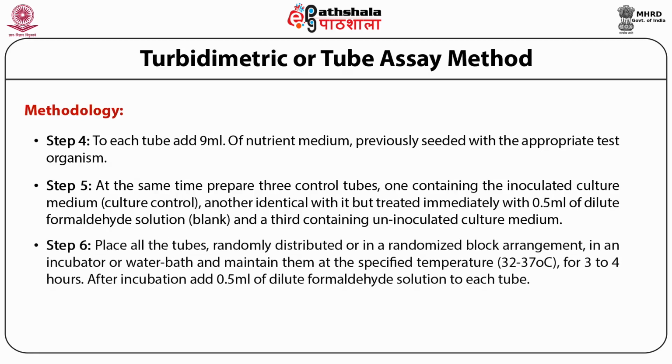Step 6. Place all the culture tubes randomly distributed or in a randomized block arrangement in an incubator or water bath, and maintain them at a specified temperature between 32 to 37 degrees centigrade for 3 to 4 hours as specified by pharmacopoeia.